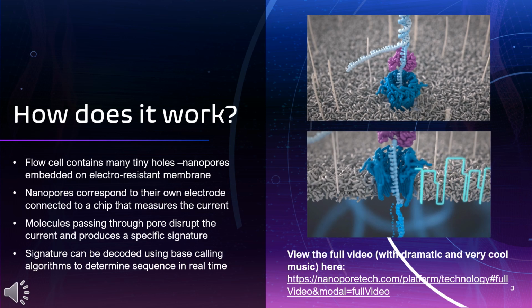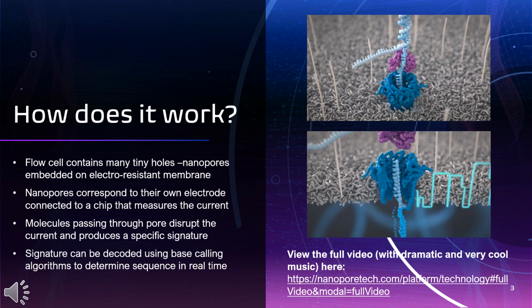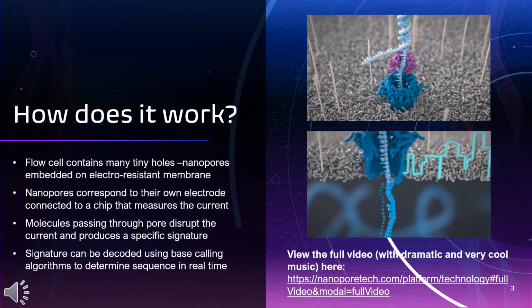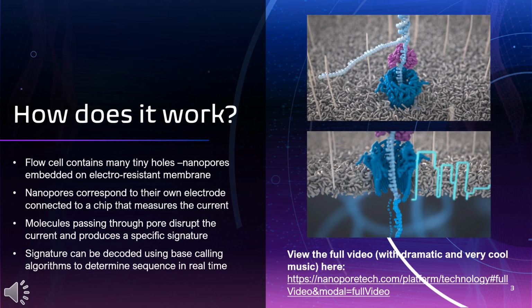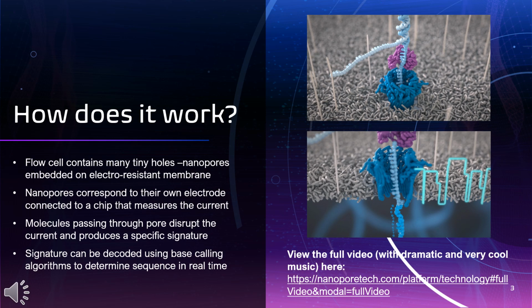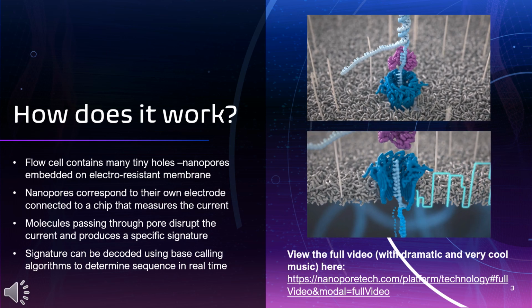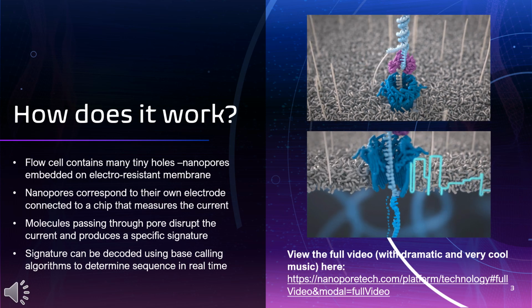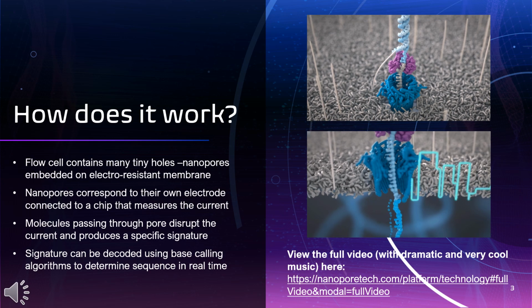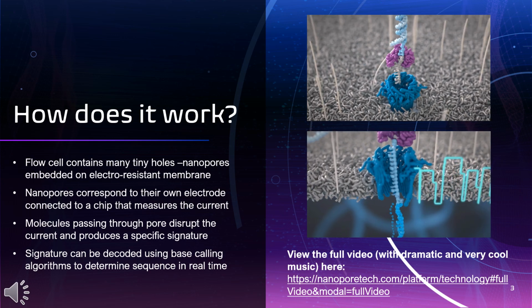So let's look more at the specifics of this technology. I've already mentioned what nanopores are. They are embedded on an electroresistant membrane that is attached to the flow cell. And these nanopores have their own electrode that is connected to a chip that then measures the electrical current. When your DNA or RNA passes through the pore, it disrupts the current and produces a specific signature that corresponds to A, C, G, T, or U, depending on what you're using. Base calling algorithms are then used to determine the sequence of your sample in real time.